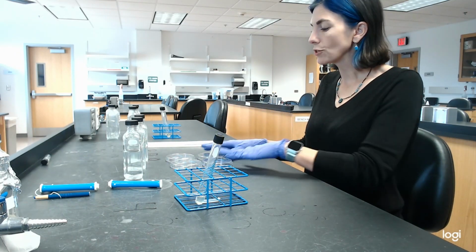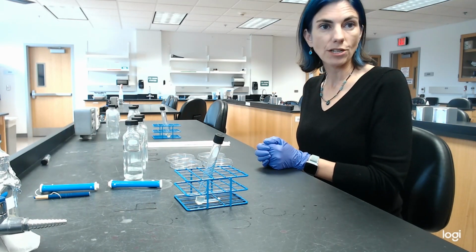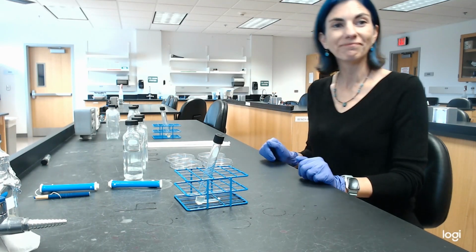And what I'm going to do now is run Lab 8 procedures as described exactly in Lab 8, right down to exactly how those dilutions are done.